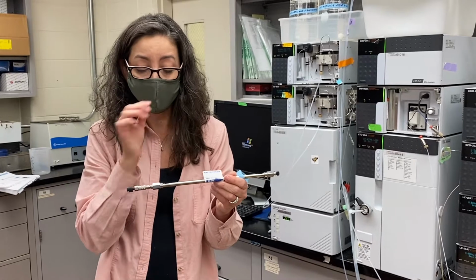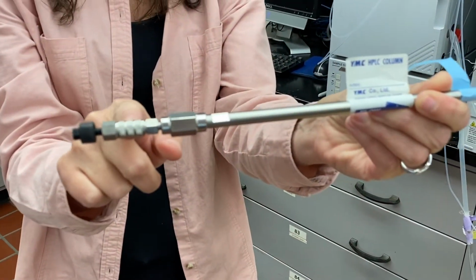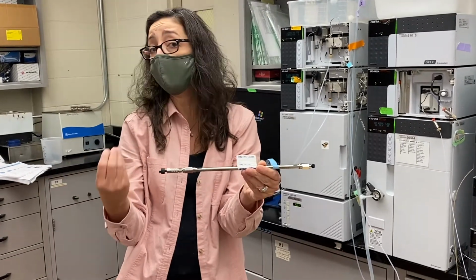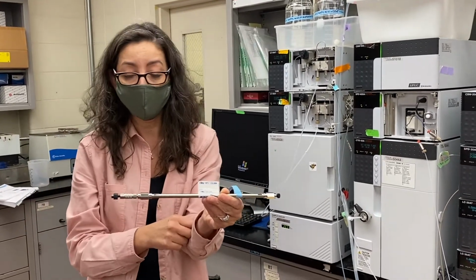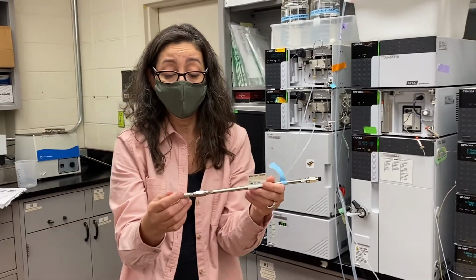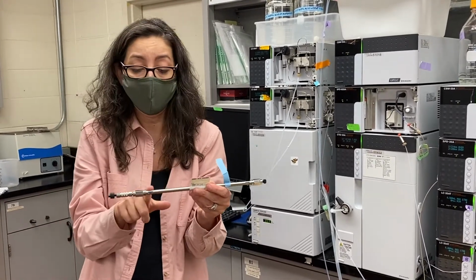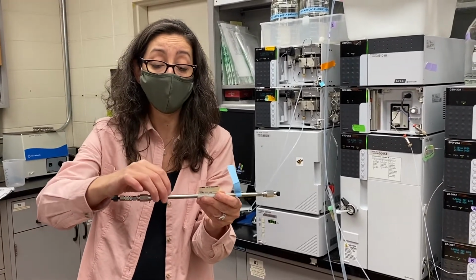Other thing that I want to point out too is the guard column right here. So this guard column, from the name, is guarding the column. When we prepare our sample, there might be impurities in the samples or the extracts that we are preparing to inject on the column. These extracts, we filter them with a 0.45 micrometer filter. However, there could still be impurities that interact very, very strongly with the column. And then if there is no guard column, they will go on the column and they block the column.